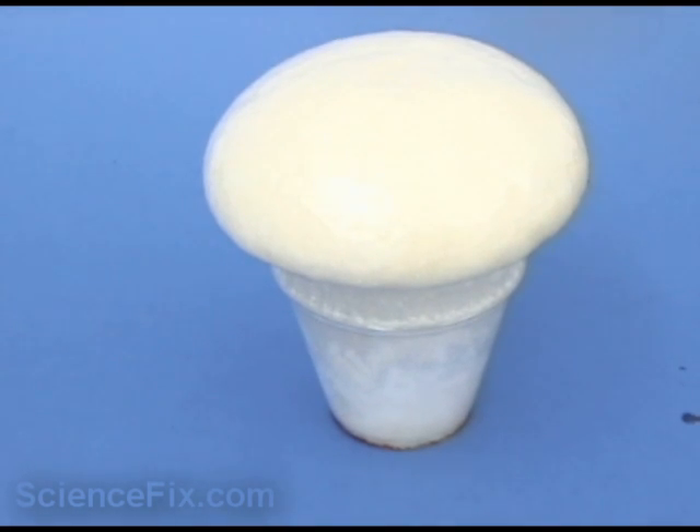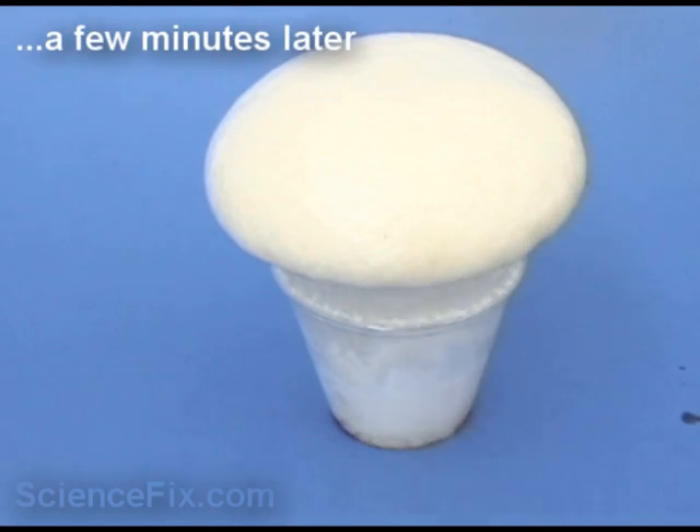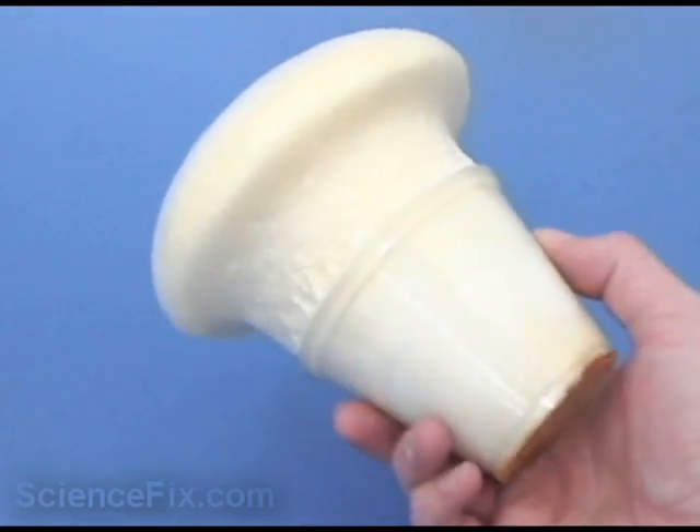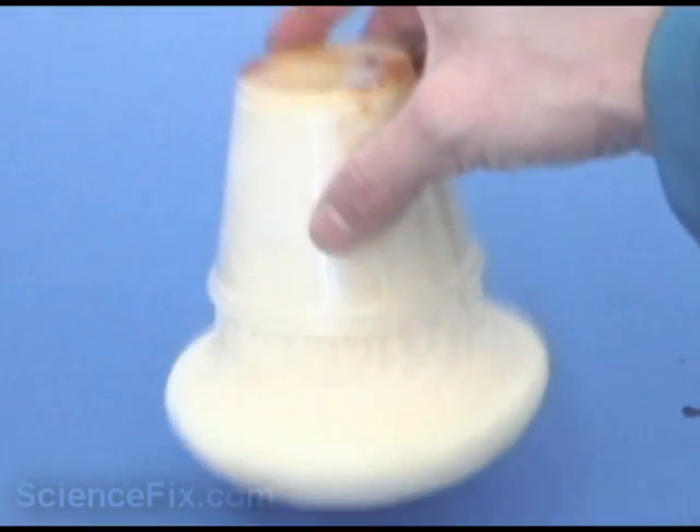After the reaction has finished, it takes a few minutes for it to fully harden and become more rigid. The uses of this polyurethane can be as an insulator in the walls of houses. It's a very good insulator since heat energy cannot pass through very easily at all.